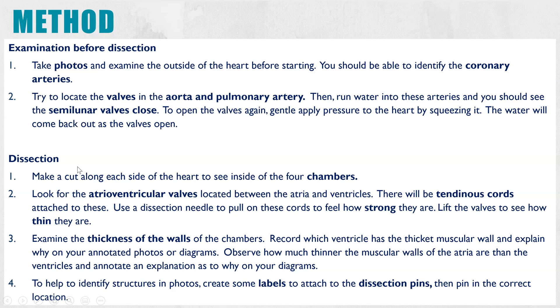Then you get onto the dissection itself. First, make a cut along the side of the heart so you can look into it and identify the four chambers: the left and right atria at the top, and the left and right ventricles at the bottom.